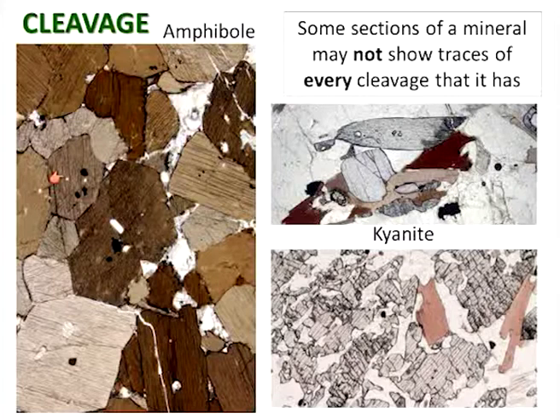But you only see those in basal sections of the amphibole prism. Most of the sections in a rock with amphiboles are cut along the prism, parallel to the prism length. And most of those sections will just show a single cleavage running parallel to the length of the crystal. Most of the rest of the grains in this view show exactly that.